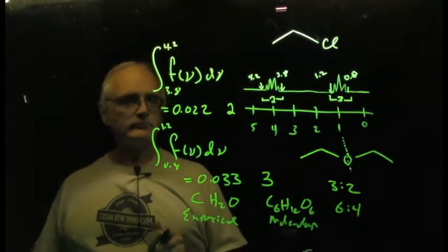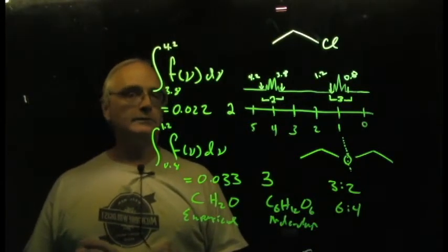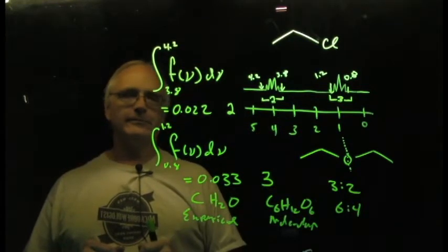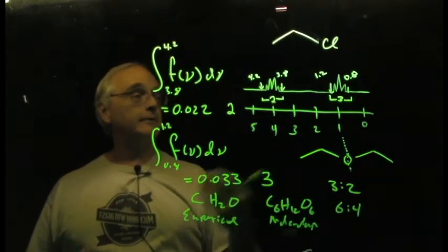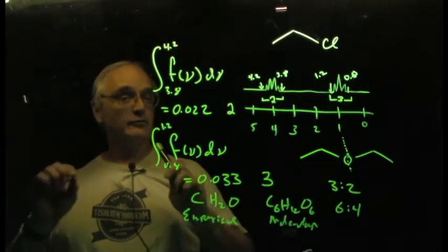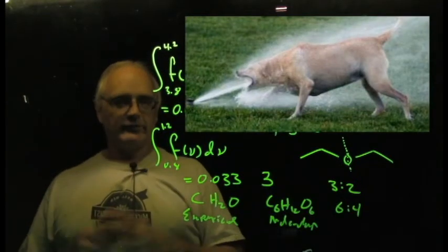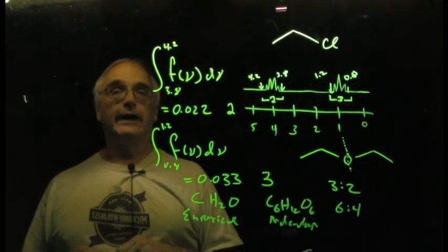So there it is, integrated proton spectra. This is a very powerful, very useful tool, and together, as we'll see in this module, with just the information of number of groups in the proton spectra, number of carbon groups in the carbon spectra, and for your proton spectra, the integration numbers, you can learn an awful lot about chemical structure from just that bit of information. It's your first sips from the fire hose of information that NMR spectroscopy gives us. Okay, so keep that in mind, practice a few of these, and talk to you later.